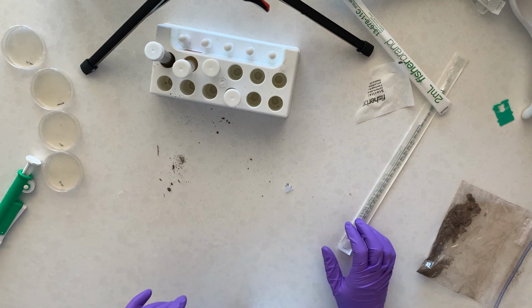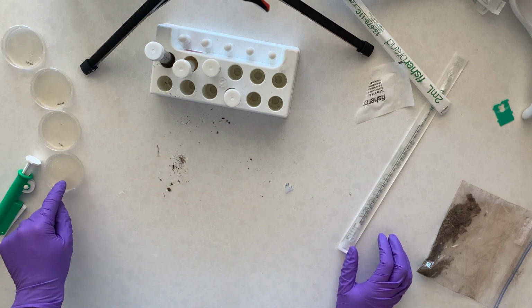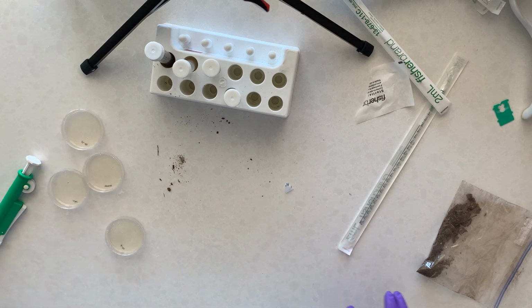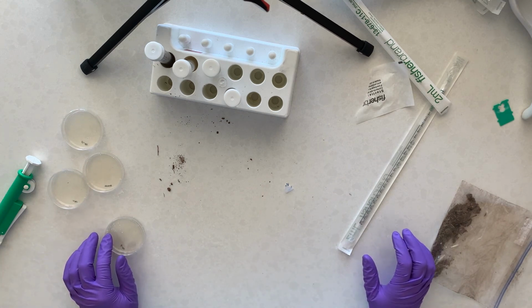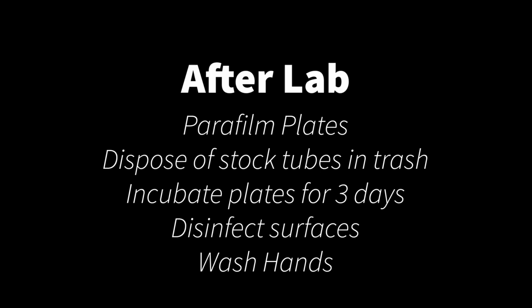As we have in the past, we're going to take these Petri dishes, we'll seal them with parafilm, and then they'll incubate for, I don't remember the number of days, probably 2 or 3 days before we do the next part of this procedure. So this is day 0, getting your culture started. Once you finish this part of the lab, make sure you parafilm your plates, and they're going to incubate for 3 days before we move on to the next step.